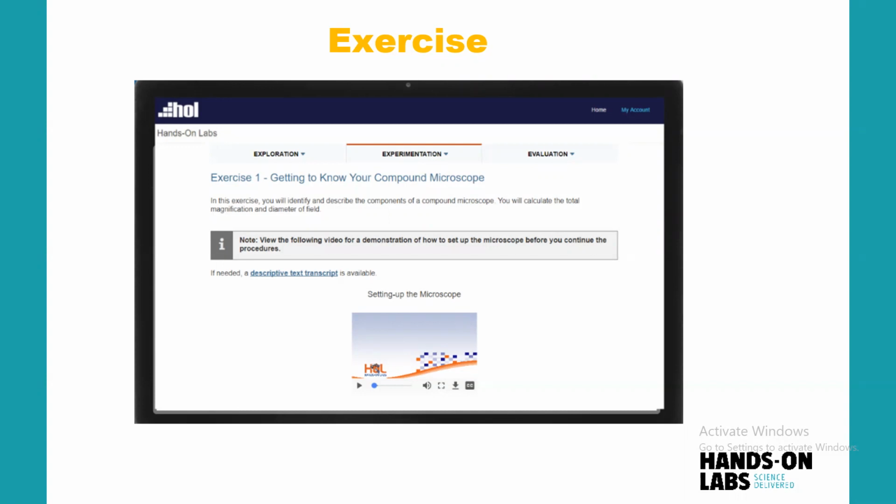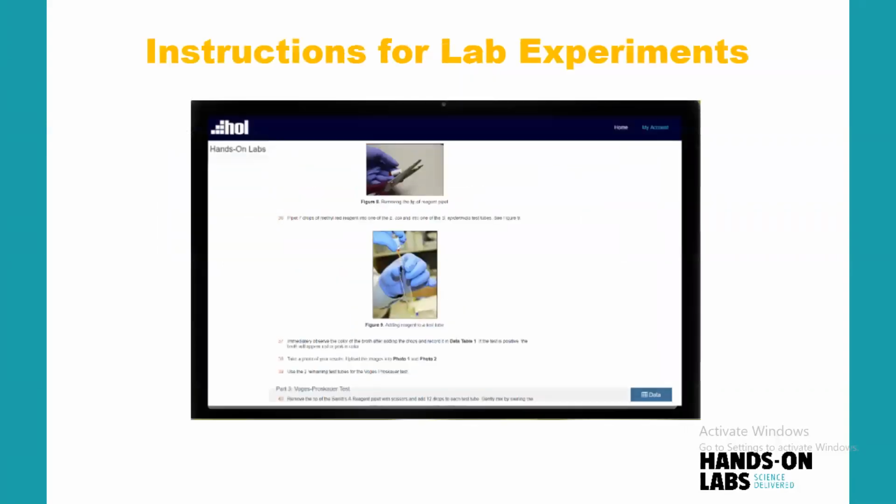Similarly, should a student be using one of those dropper chemical pipettes that Ben showed photos of in the chemistry kit, we're going to provide them with a video of how to both open and dispense the liquids in those chemical pipettes before they are ever expected to use them. Also, within the step-by-step procedure, students are presented with photographs of the physical materials in their kit and how they should be used for that particular procedure.